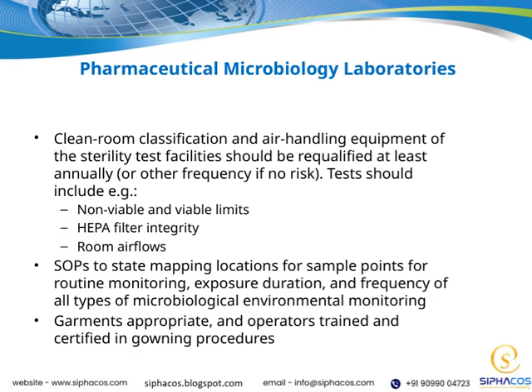Another important aspect is having clear SOPs, standard operating procedures, that specify where sample points are mapped out for routine monitoring. These SOPs should detail the exposure duration and the frequency of all microbiological environmental monitoring activities. This helps ensure consistency and thoroughness in our testing. And of course, personnel play a vital role.